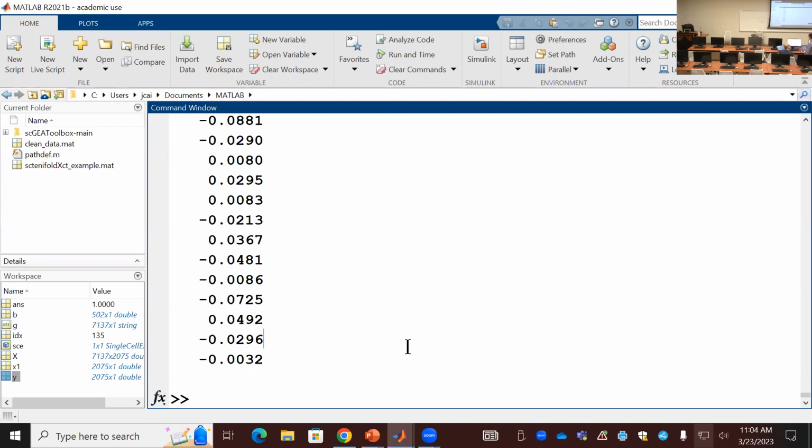Same thing. This is a score computed for every individual cell. So there are cells in there. That's the marker genes, the genes defined as M1. Yes, computed. You have two groups to compare the average. Yeah, this will be useful.